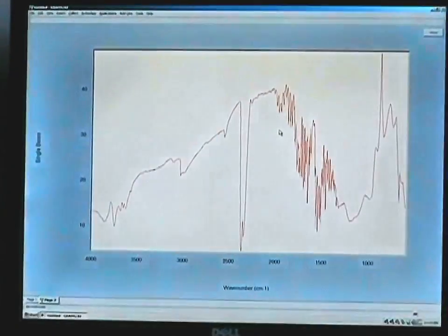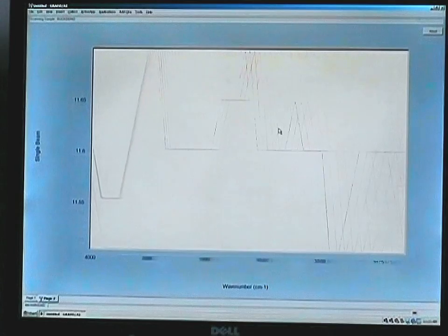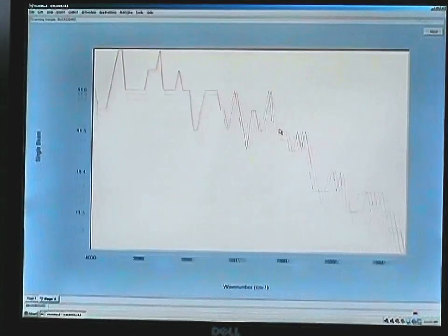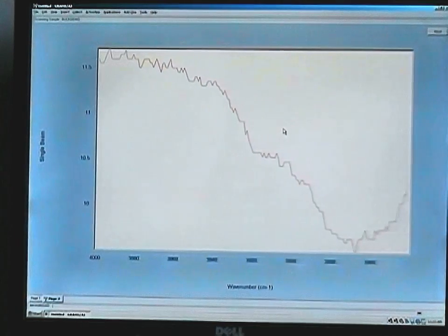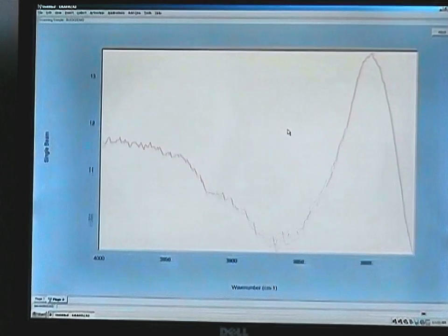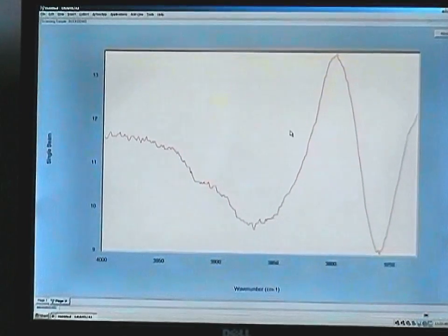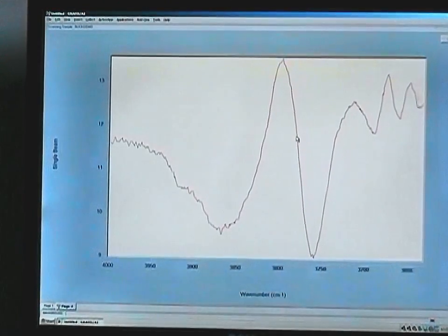Gain and time have stayed the same, and now if we click on Scan Now, we can see a real-time percent T spectrum of our sample as it's being collected. You may also just collect the single beam spectra and do the ratioing within the GRAMS AI after the data is collected, but this is a convenient feature to allow you to see the actual spectrum as it's being collected.